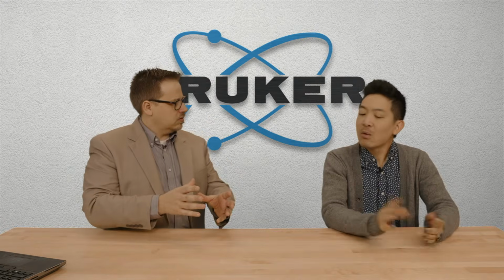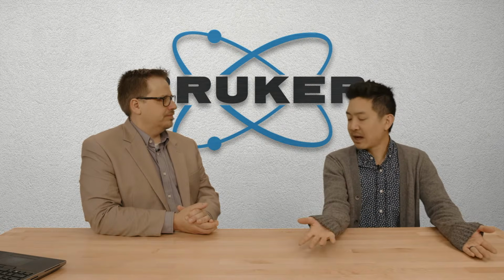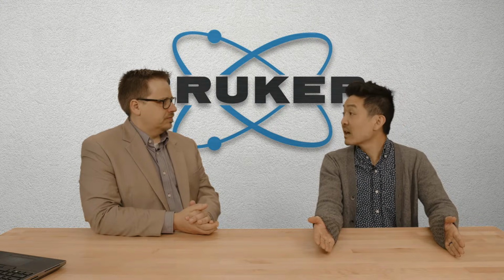Well, and one of the things that I've always tried to encourage people whenever I'm doing trainings or when I'm teaching is to make sure that you set up your experiment right. Like all good science, make sure that you've done your due diligence before you set up your experiment.